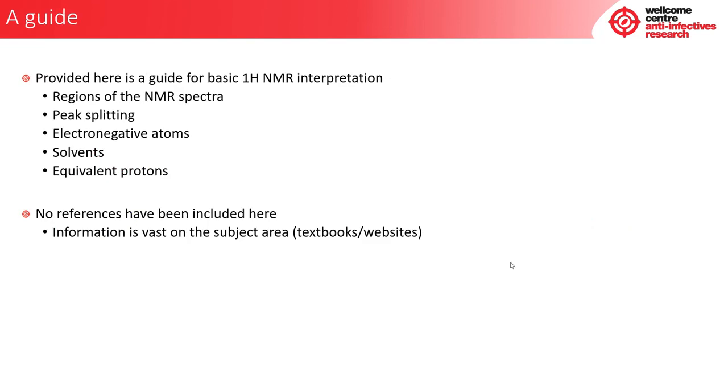So I hope so far this is a guideline to the basics of NMR interpretation, and it follows this set of rules. And like I said to you before, these rules are not referenced because they are taken from many books and many years of studying, but the information out there on the World Wide Web is vast, so do take a look at some of these. Like I said, these sets of rules are to help people, even of a non-chemistry nature, start to understand how to interpret NMR spectra.